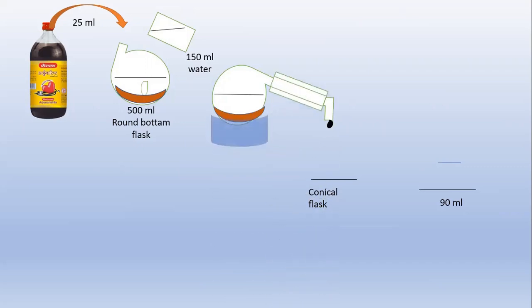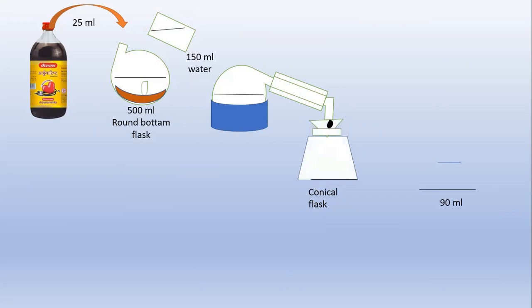Set up the distillation assembly and apply heat. The mixture is heated — the boiling point of water is 100°C, but alcohol boils at a maximum of 80°C. So the alcohol content is evaporated first, collected, and we collect that alcohol into a conical flask. The volume of distillate that collects tells us how much alcohol is present.